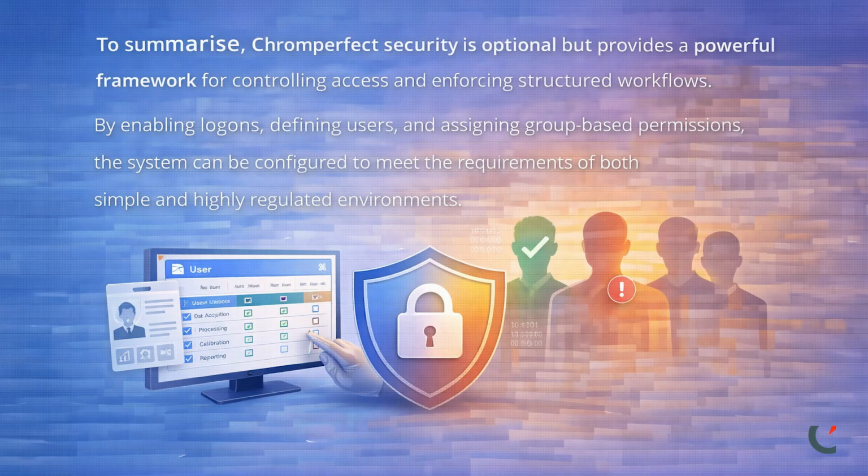To summarize, Chromperfect security is optional, but provides a powerful framework for controlling access and enforcing structured workflows. By enabling logons, defining users, and assigning group-based permissions, the system can be configured to meet the requirements of both simple and highly regulated environments.